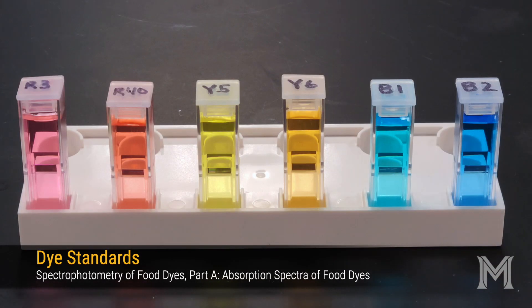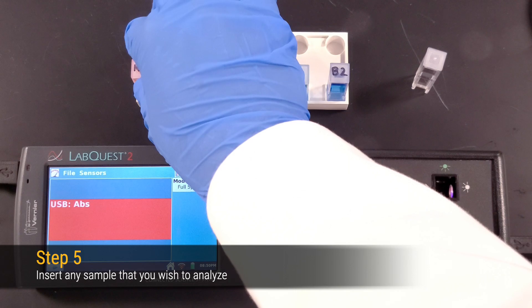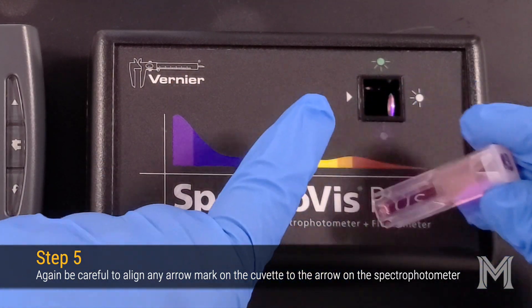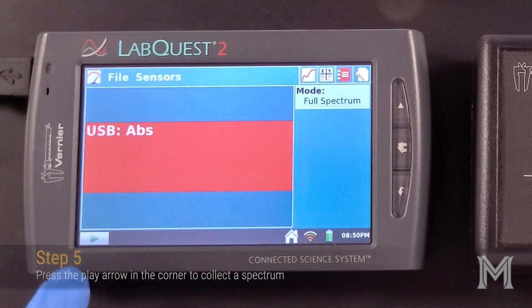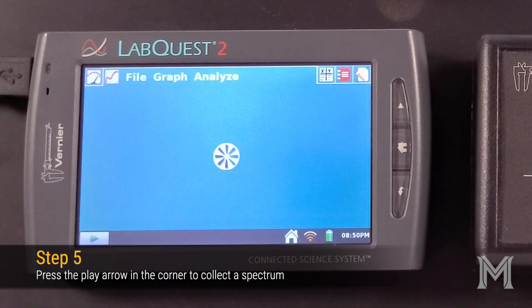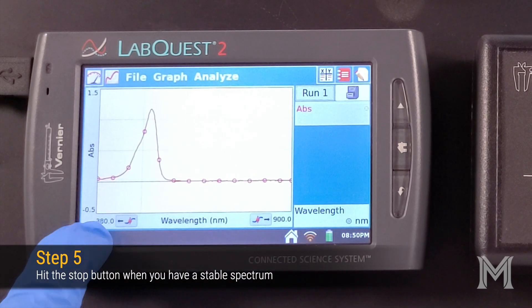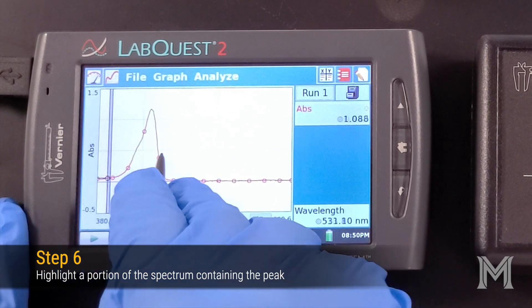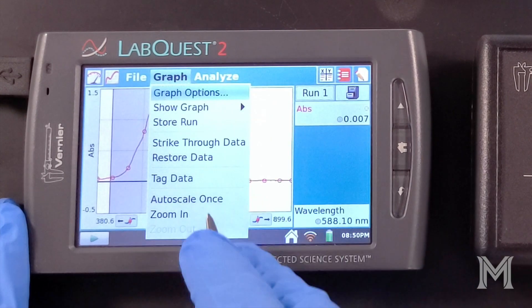You're now ready to analyze your six dye standards. Select a dye standard to analyze and carefully insert it into your spectrophotometer, making sure the arrow on the cuvette aligns with the arrow on the spectrophotometer. Use the Play button in the lower left-hand corner to record your absorption spectrum. Once you've captured a stable recording, use the Stop button to end the data collection.